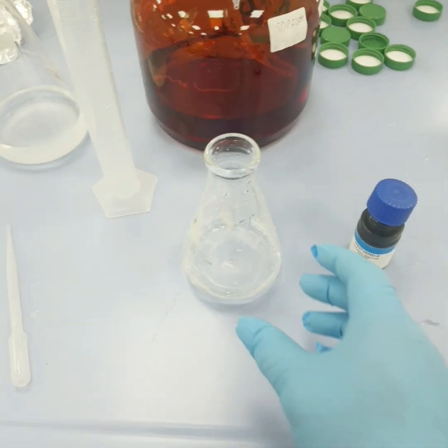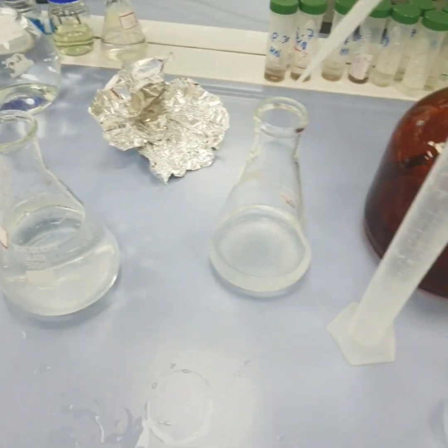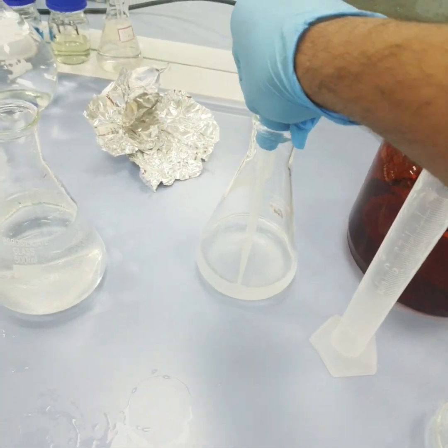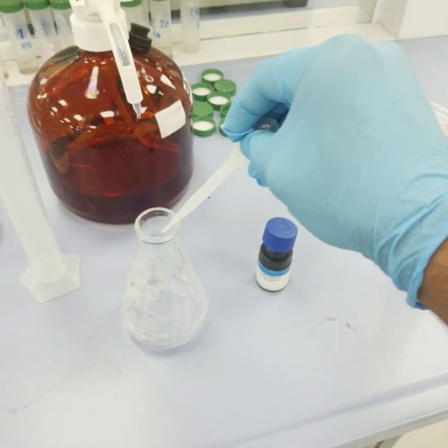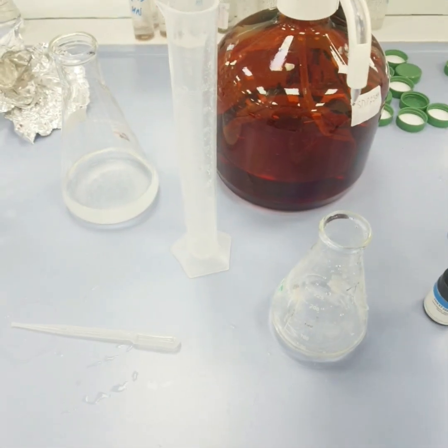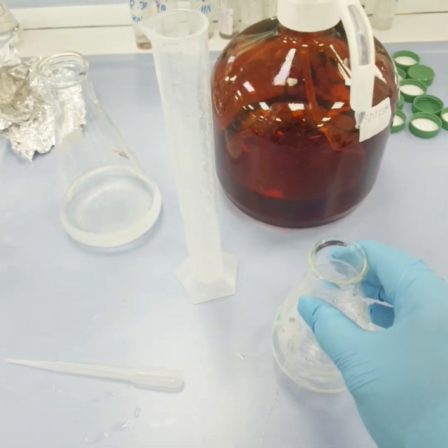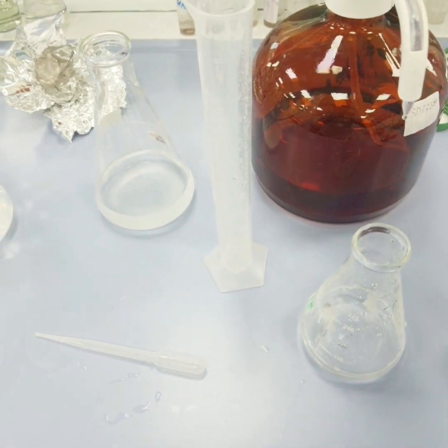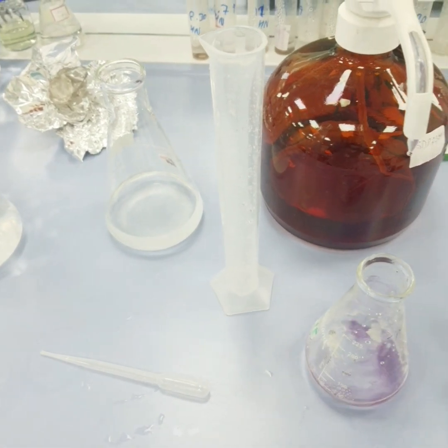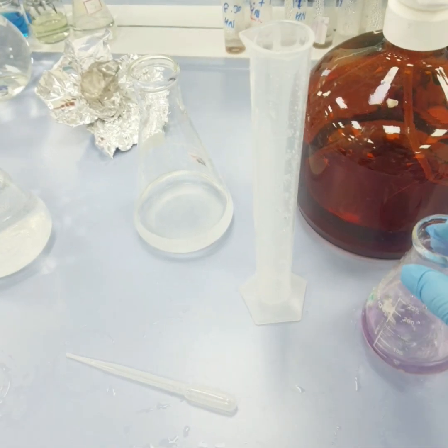Now after filtration, what we need to do is again add ammonia buffer and a few drops of indicator.